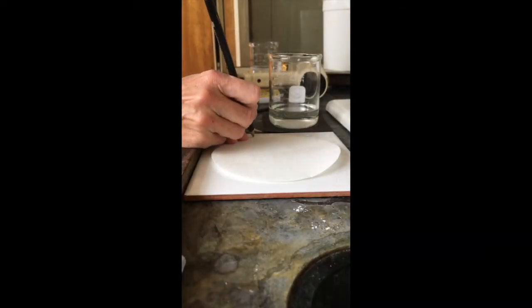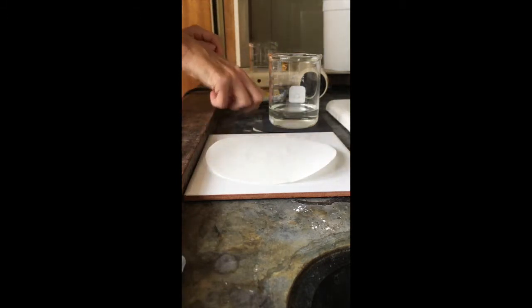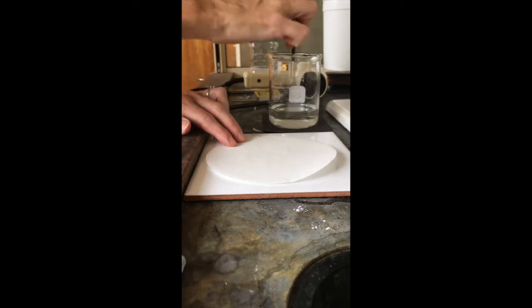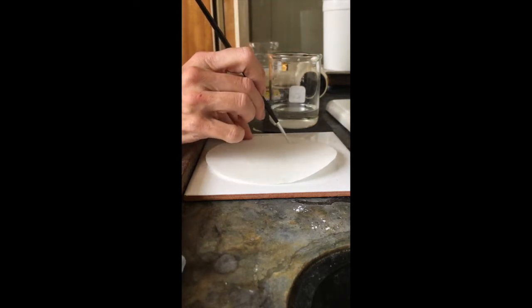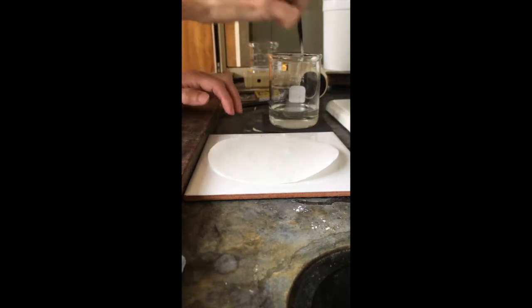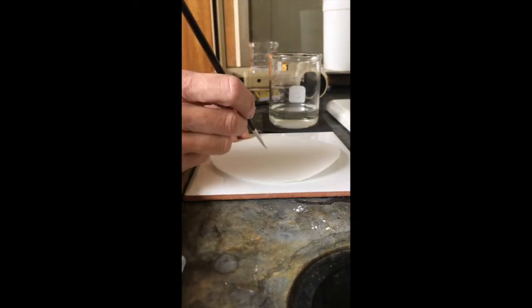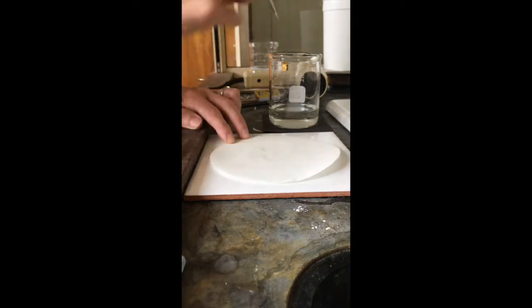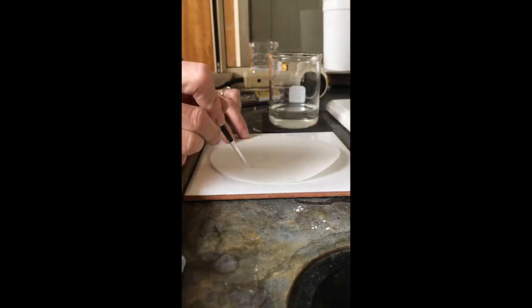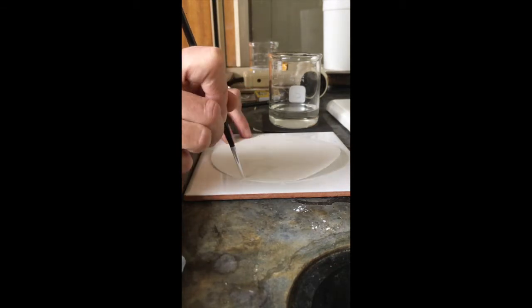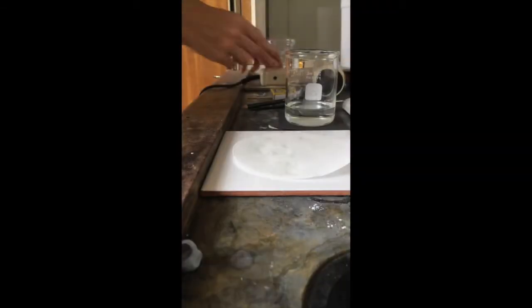Take your filter paper disc and mark with a small black pencil mark. Then take your fine paintbrush and paint whatever word you like, possibly your name, making sure to link all words so use joined up writing. Paint with the sodium nitrate solution from the left to the right of the filter paper, making sure to catch the edges.